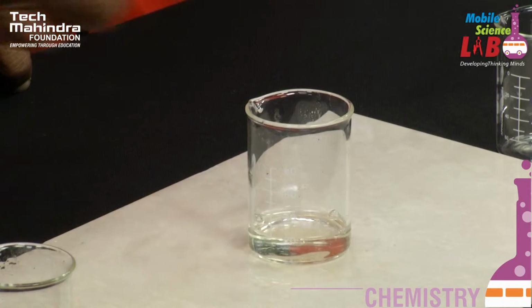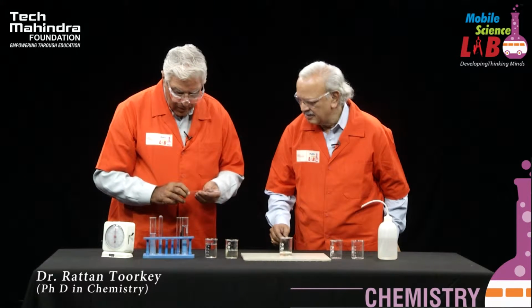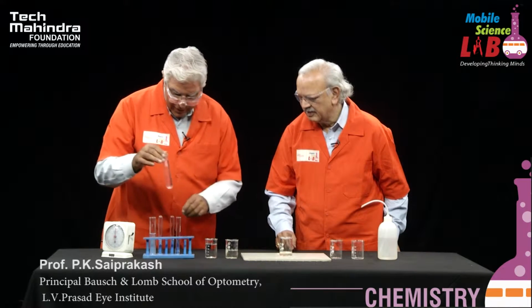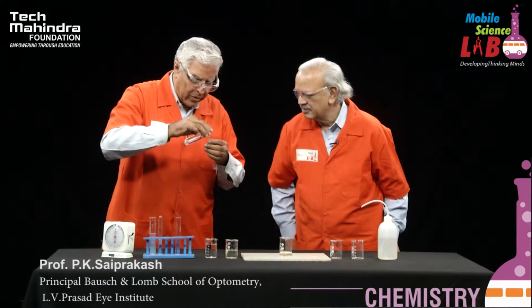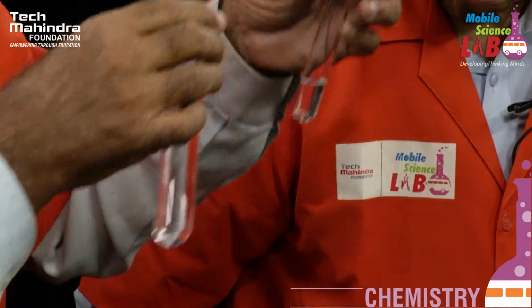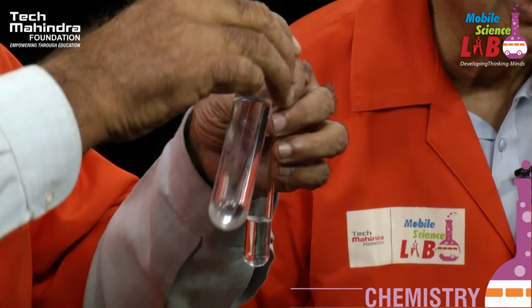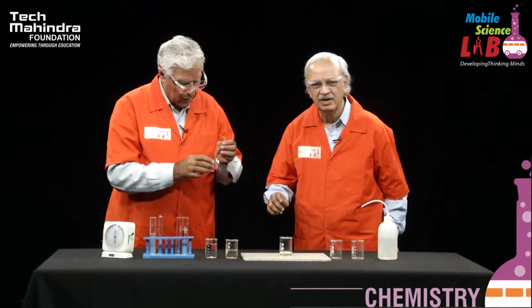Then what you do is, you take the sodium thiosulfate, about 5 ml. Sodium thiosulfate, you want 5 ml of that, roughly. So that means I take another test tube and I will just put about half of what we have done earlier. Is this enough? A little bit more. And the concentration of hypo is very low. Right? If you take about M by 20 of persulfate and M by 20 of iodide, this will be M by 200. There is a reason why the concentration is so low.